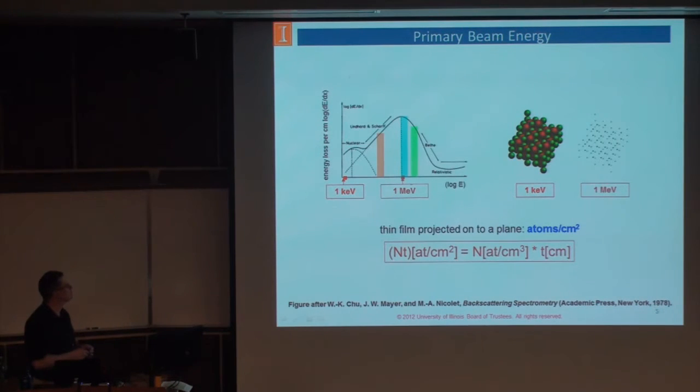When we do sputtering, like Rick talked about yesterday, we're generally working in the hundreds to thousands of eV. But now when we're doing RBS, we're up in the MeV region. What that means is you can pretty much ignore hard interactions with the electron shell because you have so much energy. So now instead of thinking of a crystal like this, which shows us lots of electron shells, we are just talking about the nucleus. You can see here you have no space to go through, but here you have plenty of space to go through. That's what happens when you're at the very high energies.